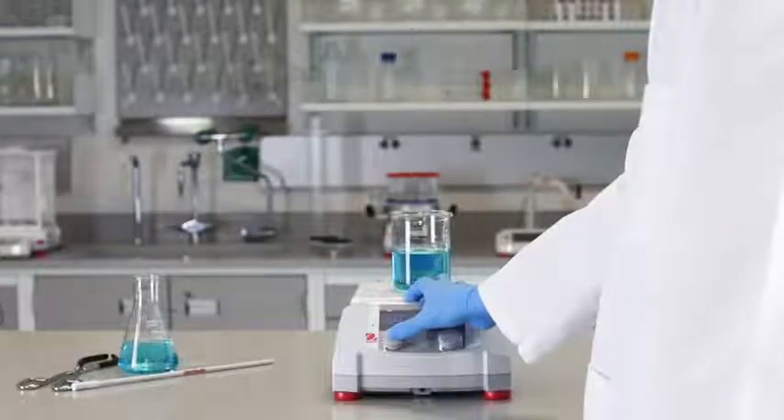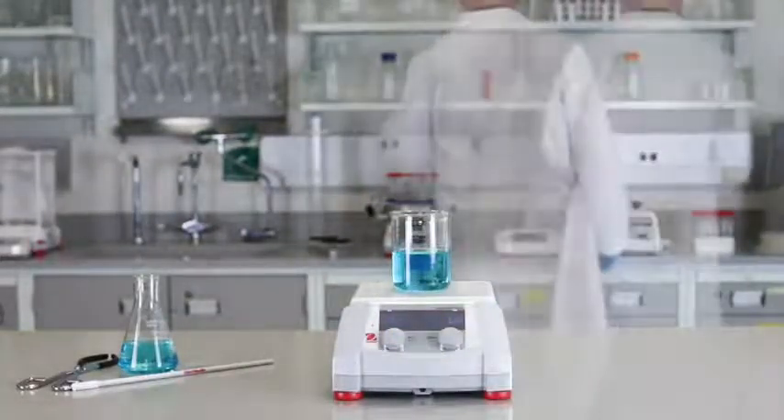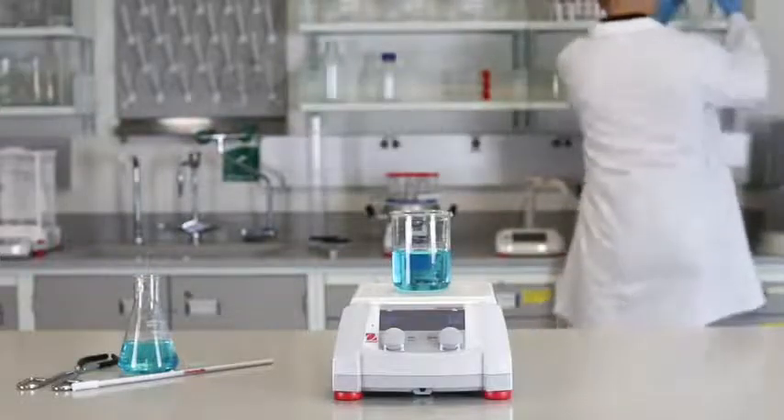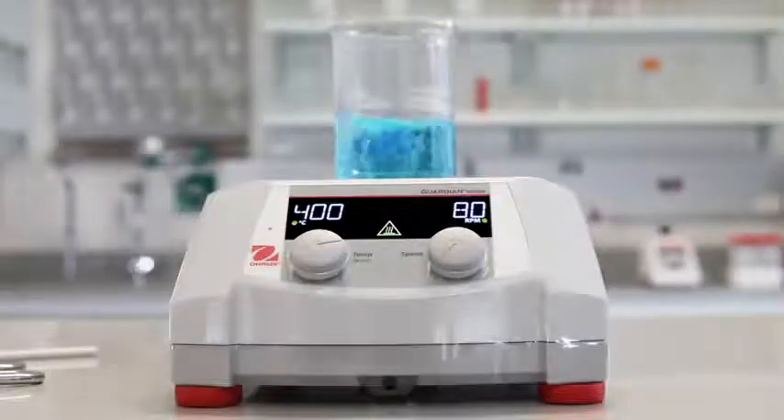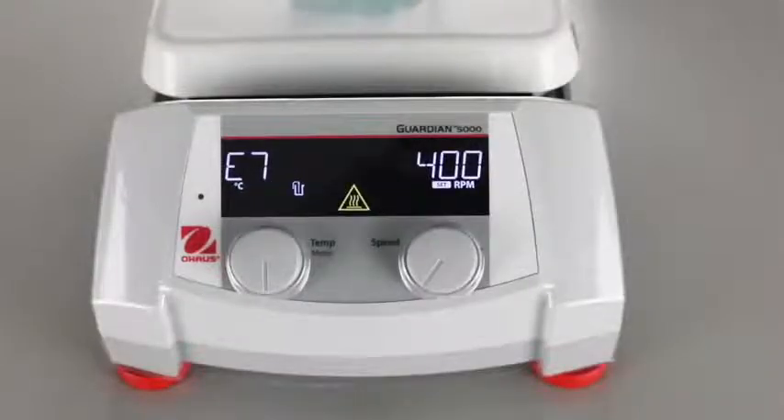All models feature Safety Heat — our industry-leading internal protection system that assures safety in heating applications with dual monitoring of system health, shutting off heating before an over-temperature condition occurs, and alerting users on the front control panel.